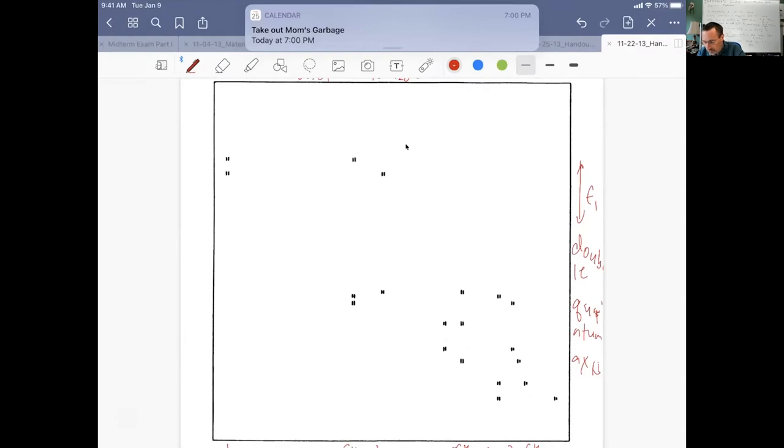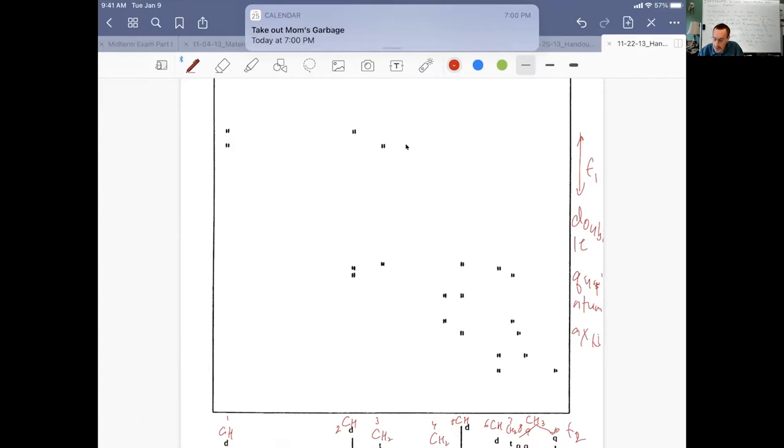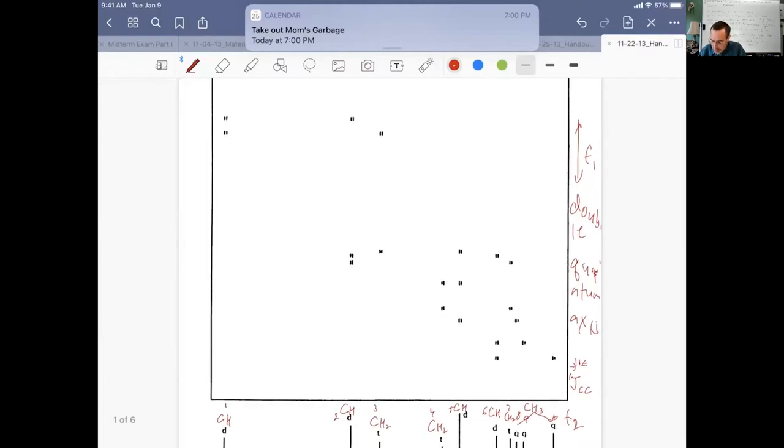Here we are with our inadequate spectrum. What I want you to first see is along the double quantum axis, we get these pairs of little lines. These pairs are separated in the carbon dimension, and these pairs are actually separated by J_CC, the carbon-carbon coupling. Carbon-carbon coupling constants are about 20 hertz if I remember correctly.